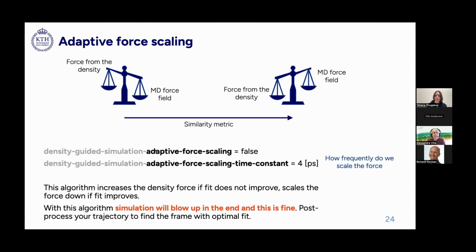There are 2 parameters that correspond to that algorithm. The first is called adaptive force scaling. You can set it false or true if you want to use it or not.